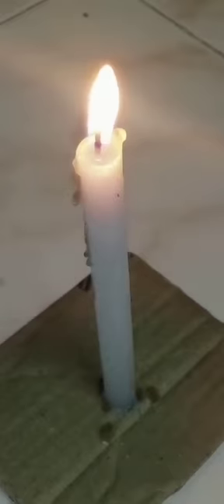Next, hold a piece of cardboard above the candle flame for 30 seconds. What do you observe on the cardboard? You will see black soot deposited on the cardboard.